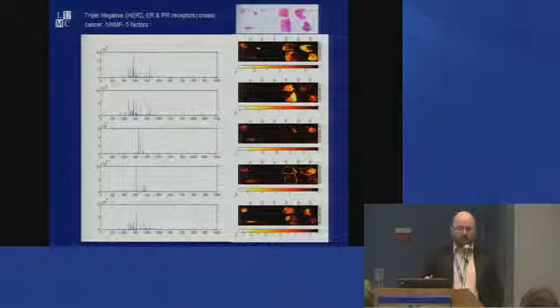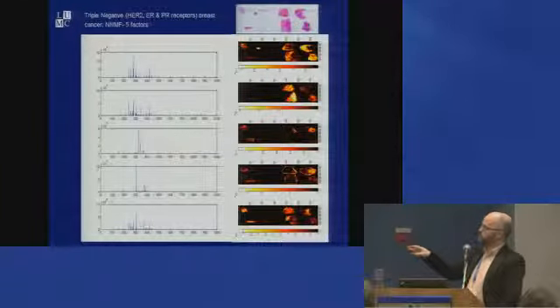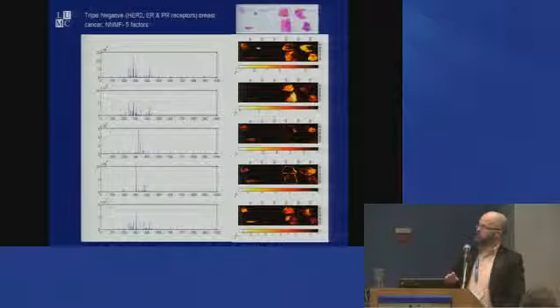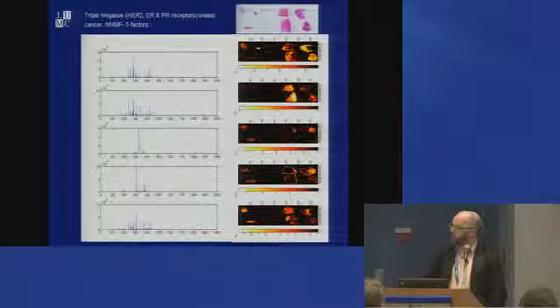One of the things I like in imaging mass spectrometry, I am a mass spectrometrist, is to annotate the tissues on the basis of the mass spectral signatures. And so we use different multivariate methods. In this case, it's a non-negative matrix factorization. I almost never use PCA. I don't like it. I could speak at length about it.